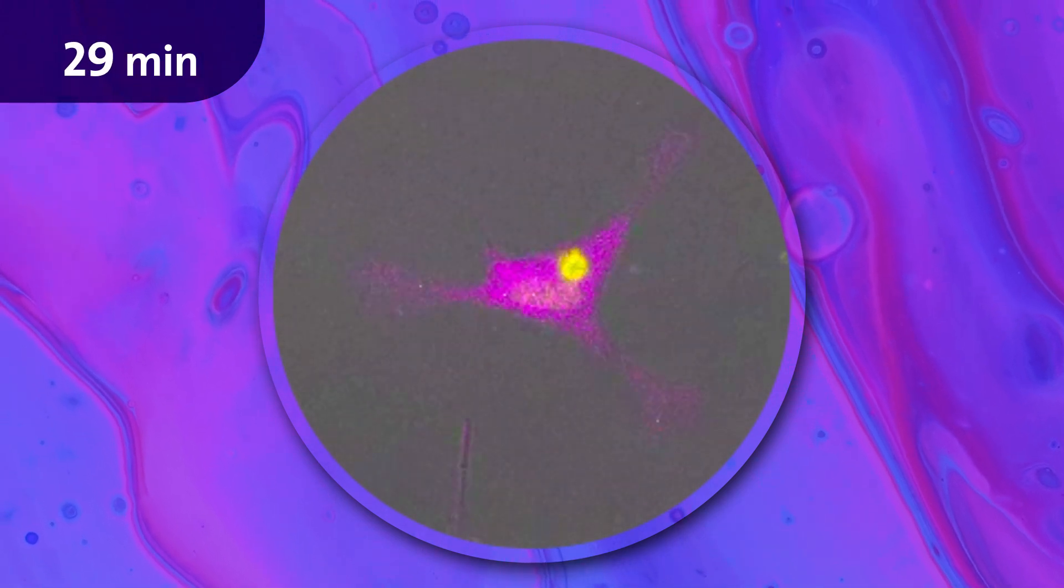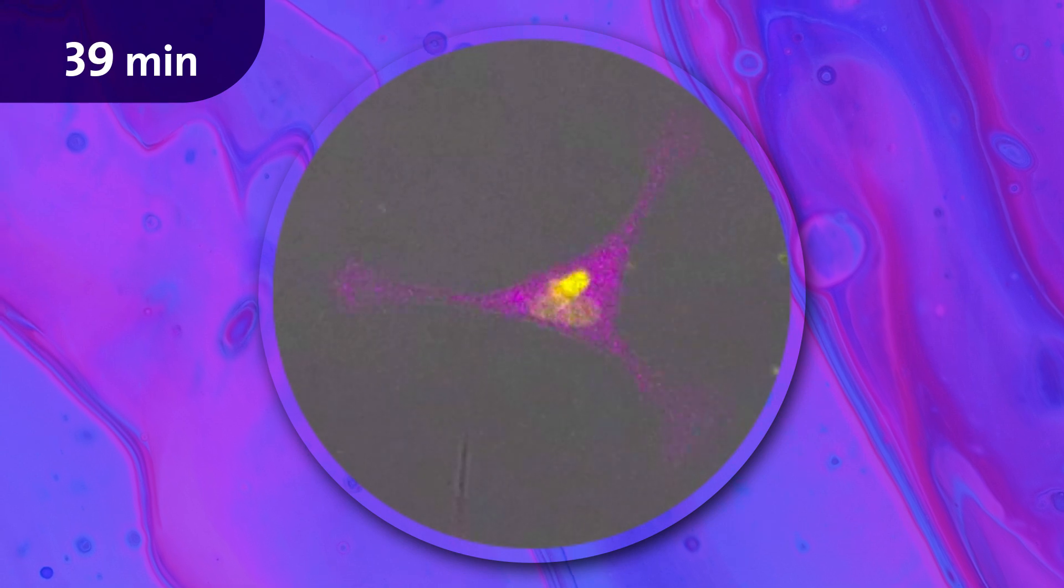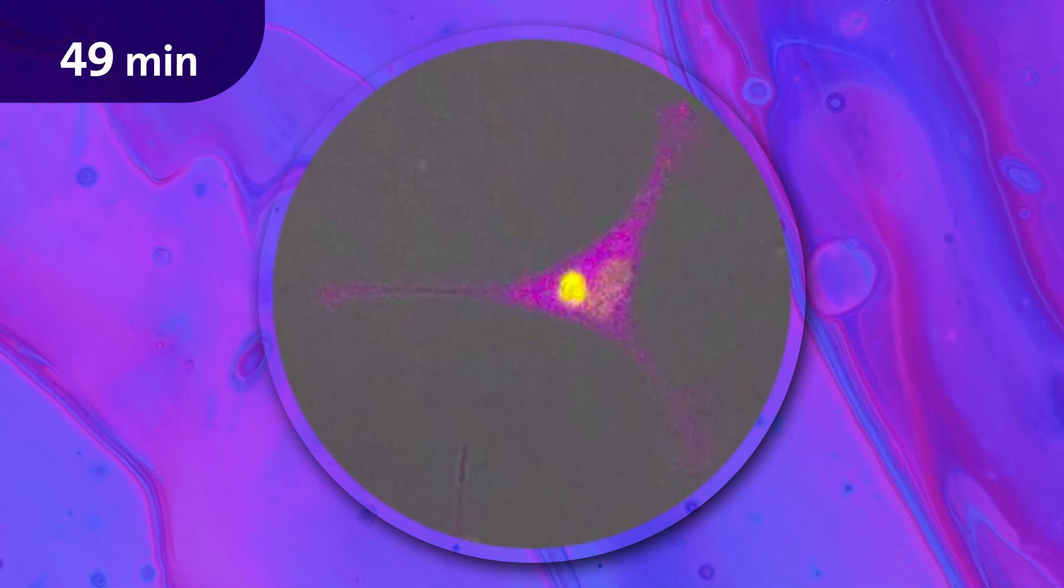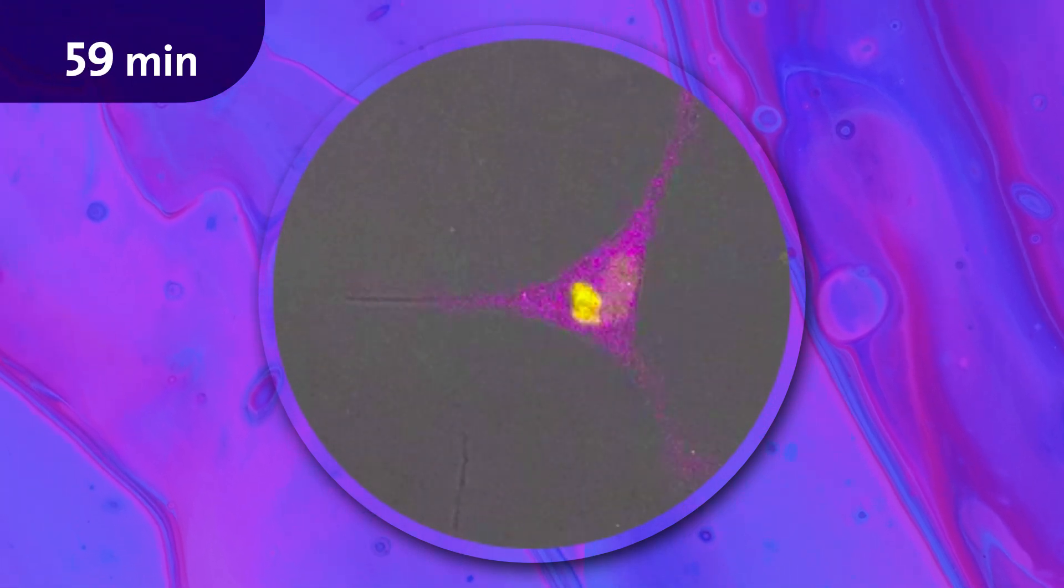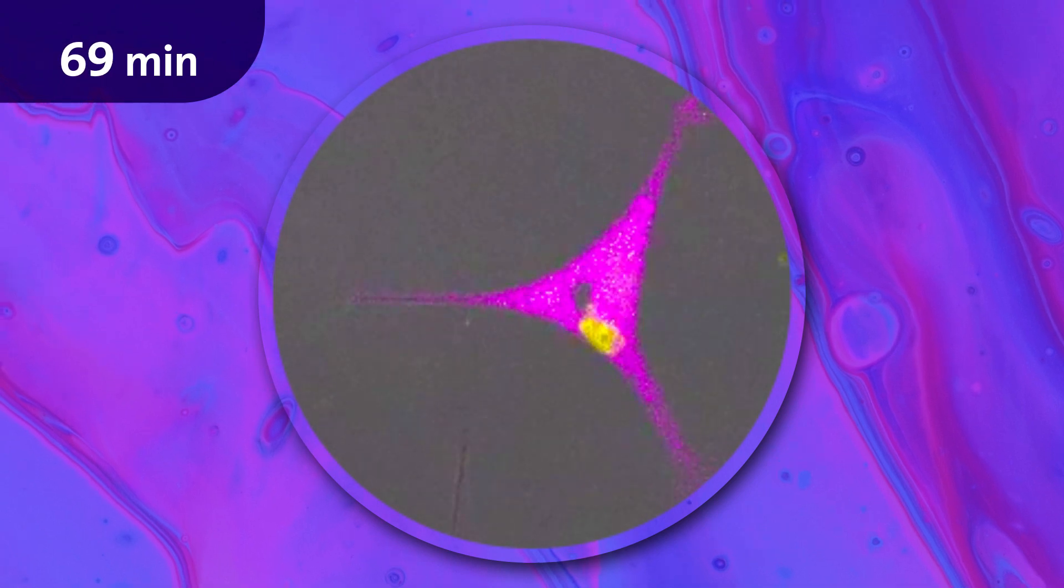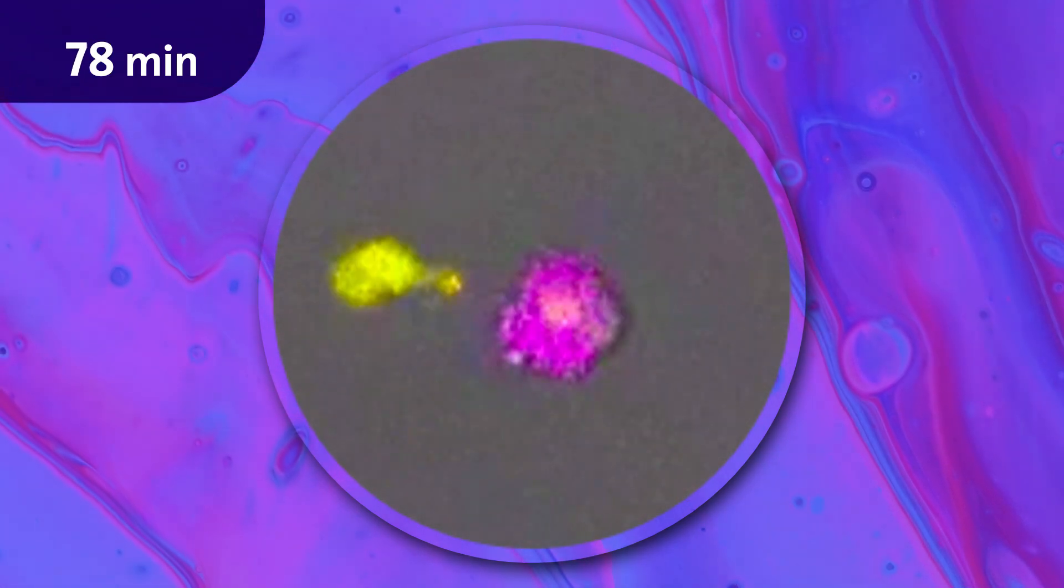This killing process often takes several hours and consists of several stages. The death is visible as rounding up of the tumor cell, followed by dynamic blebbing and disintegration.